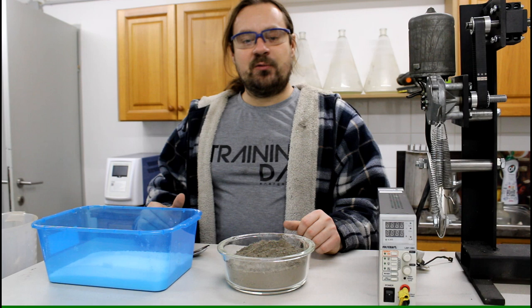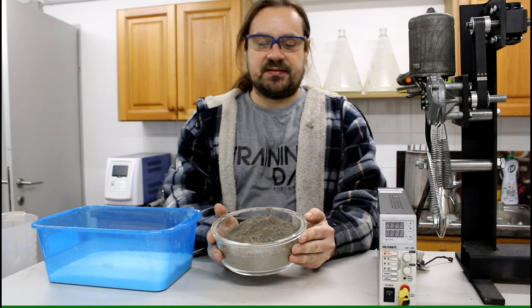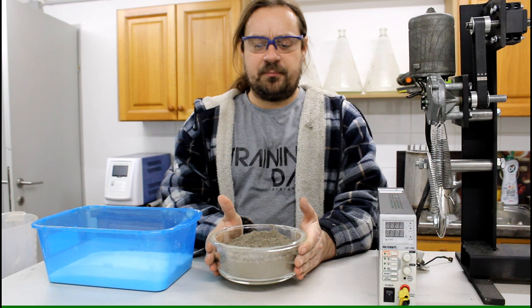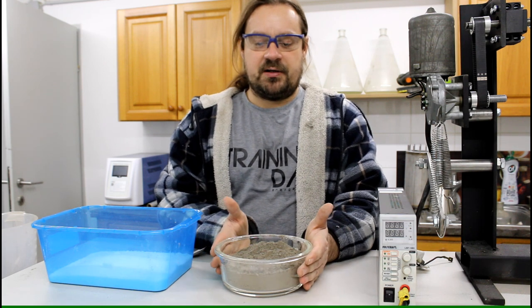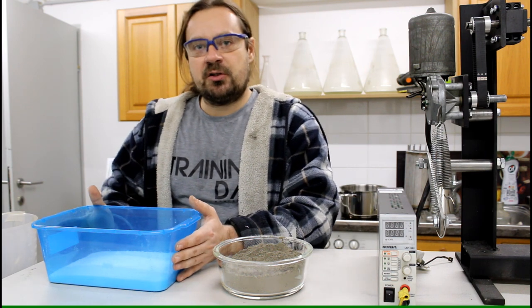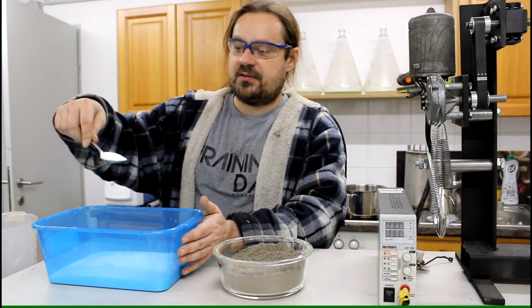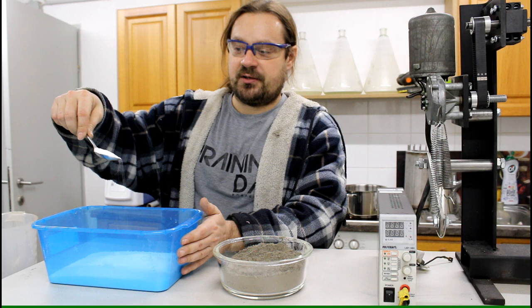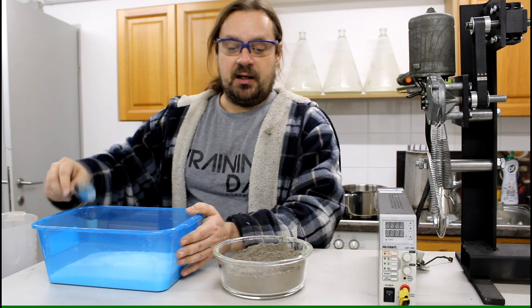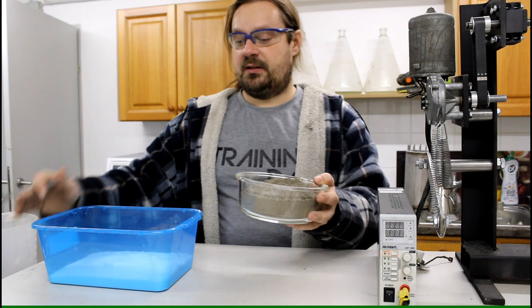Okay, the way I'm doing it is I'm having some mineral here. In this case it's a black volcanic sand that's very finely ground to a very fine powder. These are 800 grams now. So I have measured the same amount of sodium hydroxide. So here I have sodium hydroxide pearls or granulate. It's a very fine granulate. And I'm going to mix it. So 800 of this, 800 of that. It's 1600.